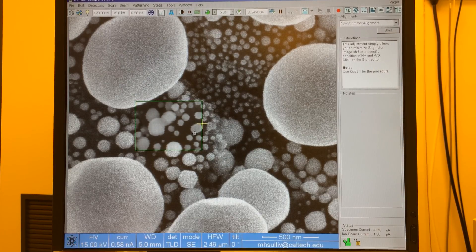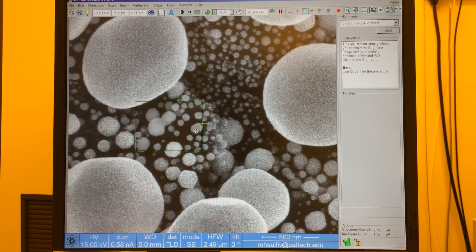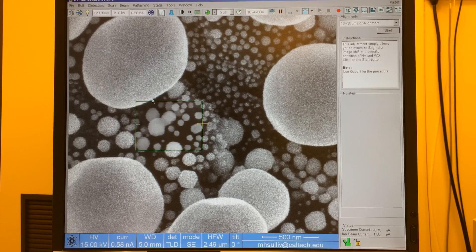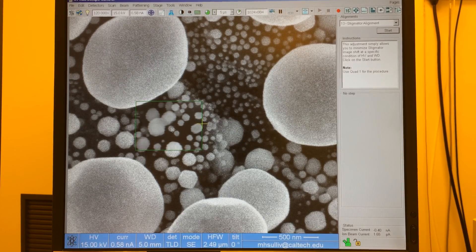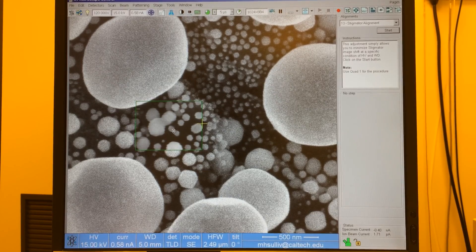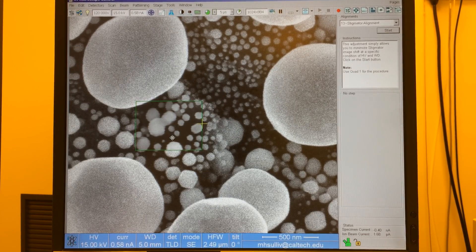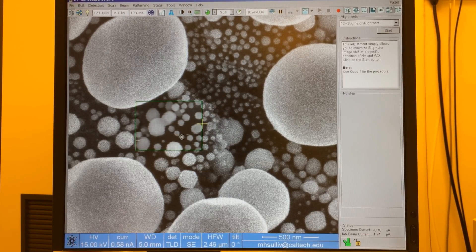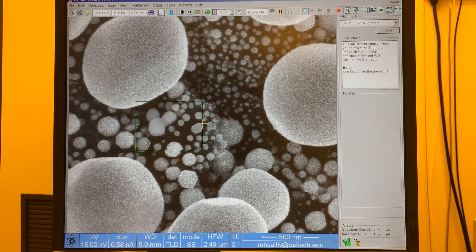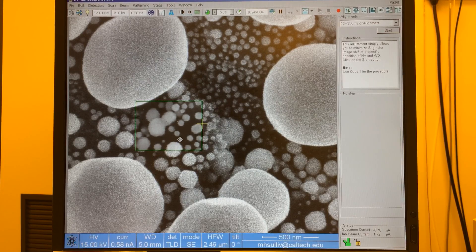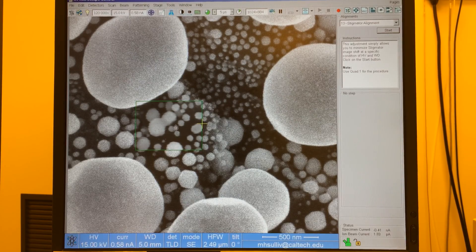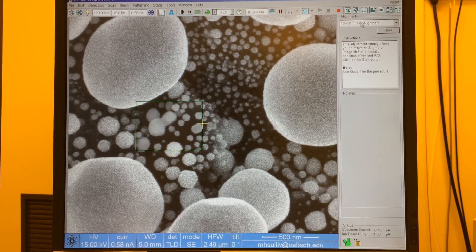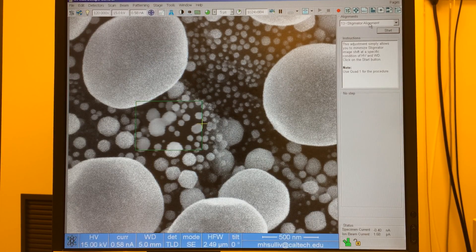In most cases you won't have to do this. We keep it pretty well aligned. But while you're doing your imaging if you notice that visual cue, if you notice the image shifting while you're adjusting astigmatism, then that's your cue to go and fix the stigmator alignment.